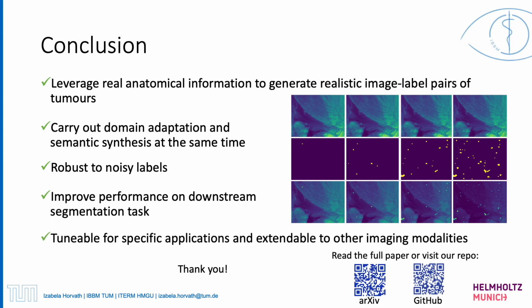Furthermore, we presume that this method can be extended to other imaging modalities, such as MRI, CT, or other types of microscopy to create contrast-enhanced label data.